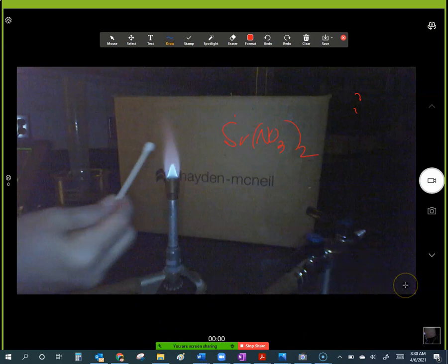So, one last thing. Let's do red. This line, anybody know what this line does for us? What does this line represent?